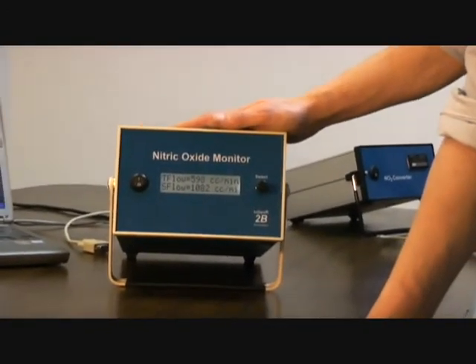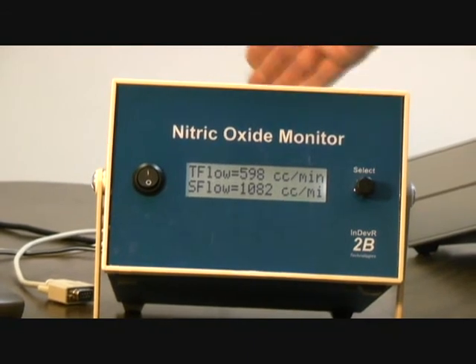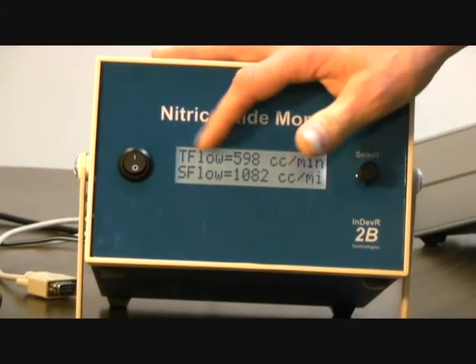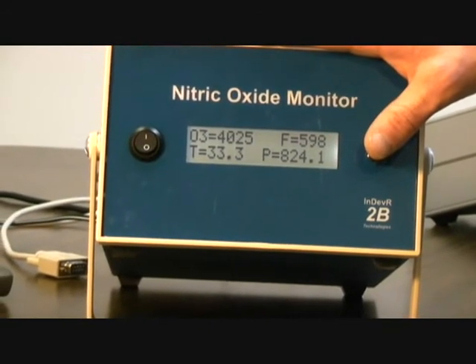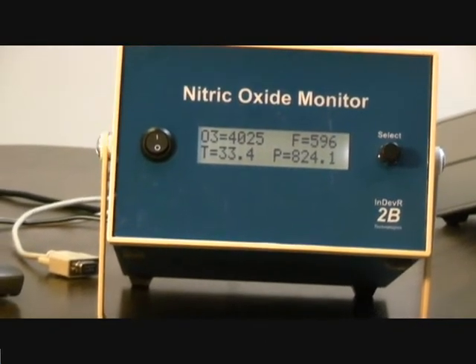Now you'll notice, I don't know if you can hear it, but the tone of the pumps changed because it was readjusting the flow rate, because we just set it to the default duty cycles for the flow rate. So it just reset the total flow to be 600. And that is how to use the administrative menu.